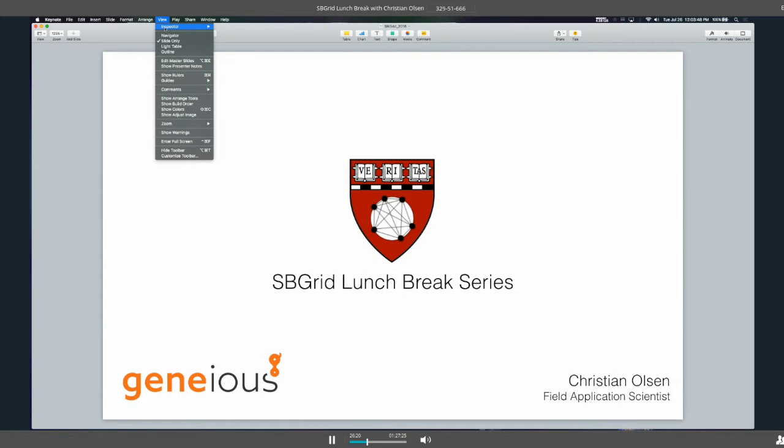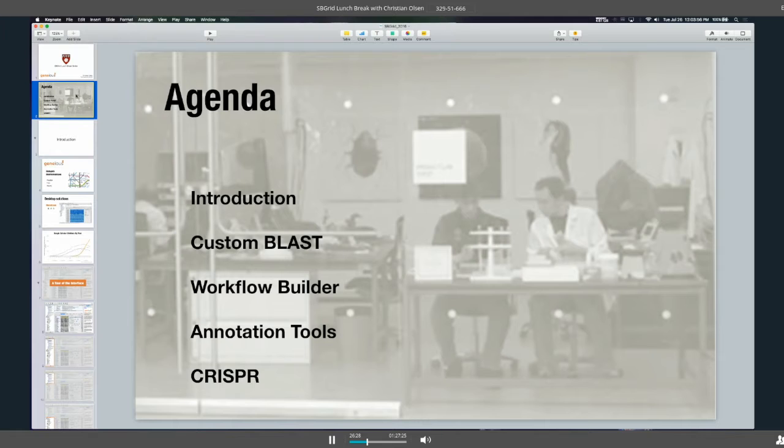What I need to do is give a little bit of background on how the software works and in terms of orientation, which we'll get into briefly, but I wanted to provide an agenda for what we'll be talking about. It's a bit of a variety, and we do have a lot of material to cover, so bear with me as I move through this. I'm happy to entertain questions afterwards, and I'll also provide my email address for those who have more in-depth questions.